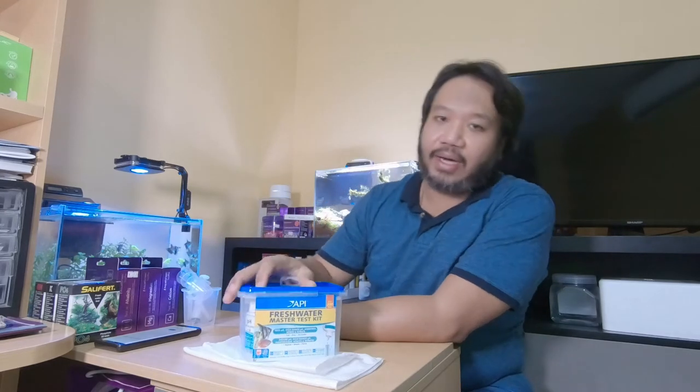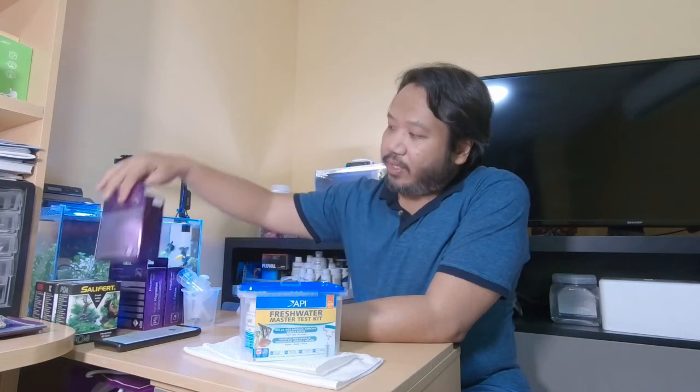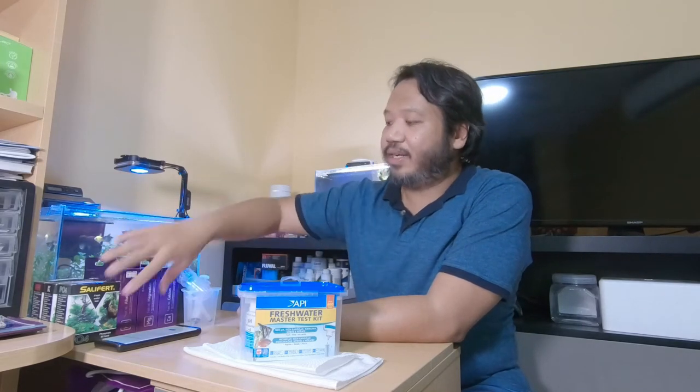As you know, aquarium water needs to be in tip-top condition so that your fish, plants, and reefs can survive. There are many types of testing equipment and testing kits you can buy out there. Mainly what I use is the API. I also have the Salifert test, Aqua Forest test, and Nios test. Basically, all of these are for testing my other aquariums.